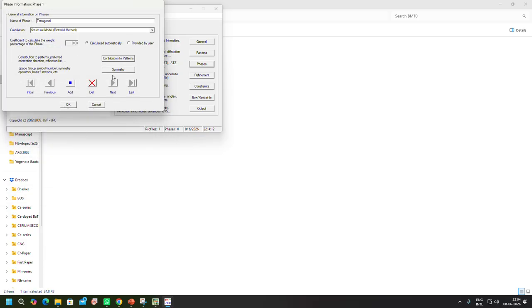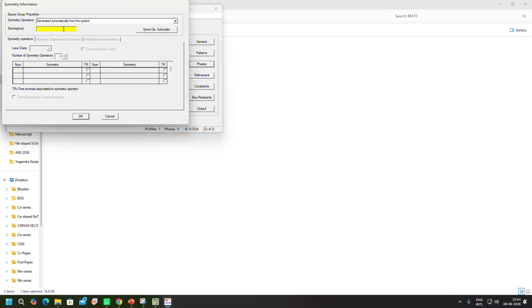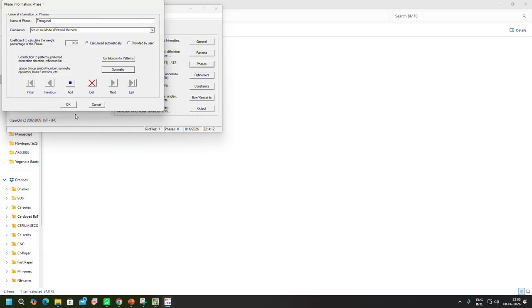Okay, now go to the symmetry. You first give the space group for that particular crystal structure, as I have shown you at the start of this video. Then okay, and then you add another phase.